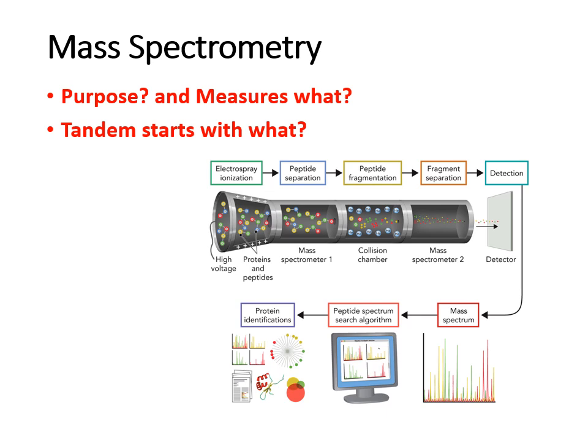So now, moving on to some other protein-related techniques, we have mass spec now. So mass spec, it basically allows us to measure the mass of small peptide fragments. And what exactly it's measuring is the mass to charge ratio. And ultimately, this is a great way for us to identify proteins based on their mass.